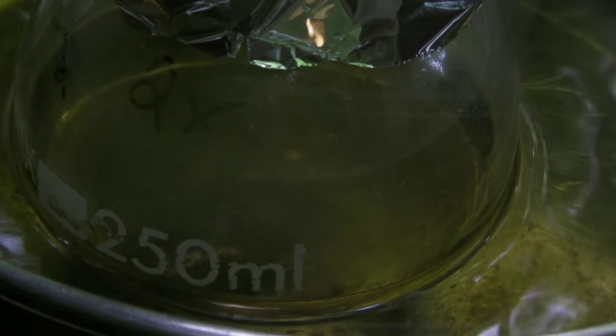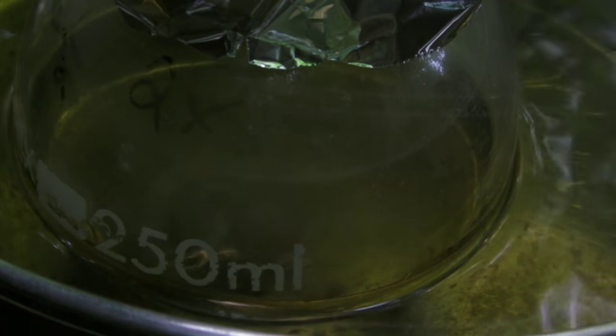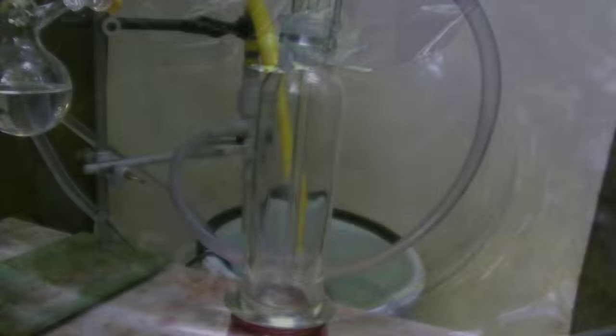The boiling point of the benzaldehyde is at 109 degrees C, which means that the pressure is low enough to lower the boiling point by 70 degrees C. The distillation is finished when only a small amount is left in the flask. A distillation is never left to run until the flask is dry.